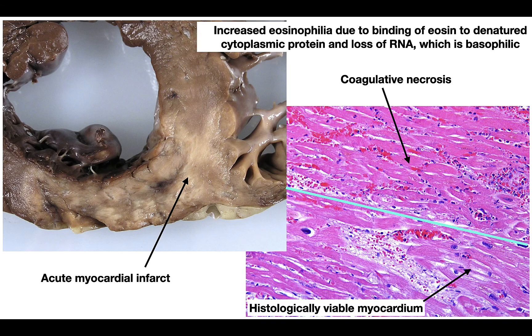With coagulative necrosis, here's one example in the myocardium. In the top left you can see an acute myocardial infarct in the septum and inferior wall of the left ventricle — that yellow discoloration corresponds to what we see to the right. In this section you can see both histologically viable myocardium at the bottom and coagulative necrosis at the top. At the bottom you can see nuclei are preserved, whereas at the top you see the cardiac myocyte structure but without the nuclear or cytoplasmic basophilia.